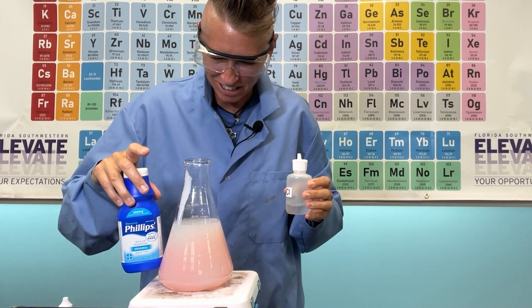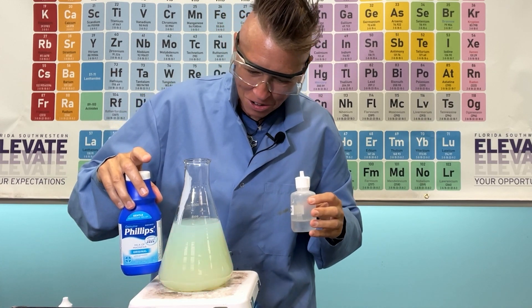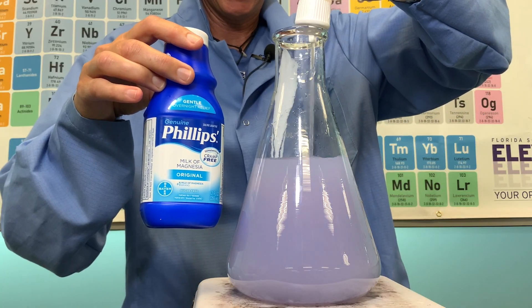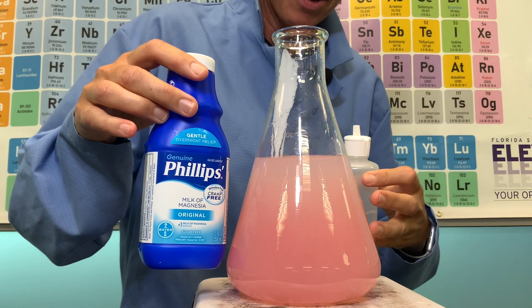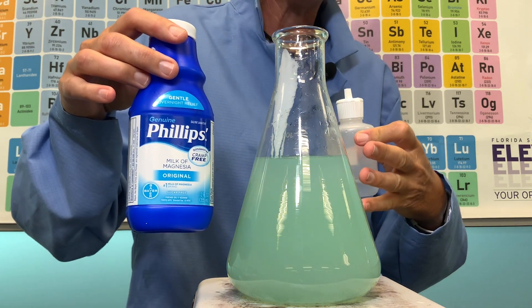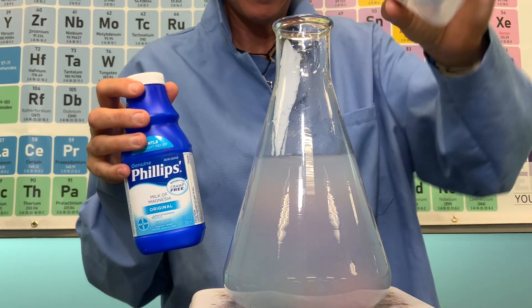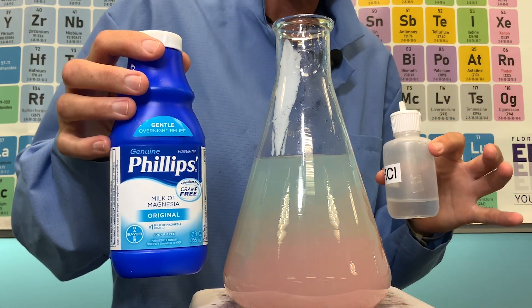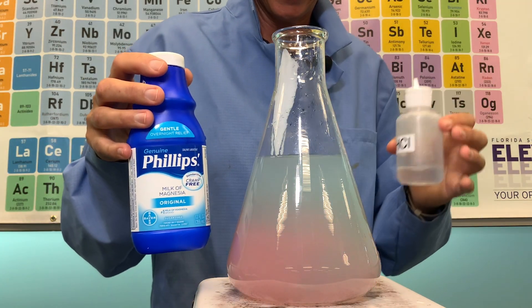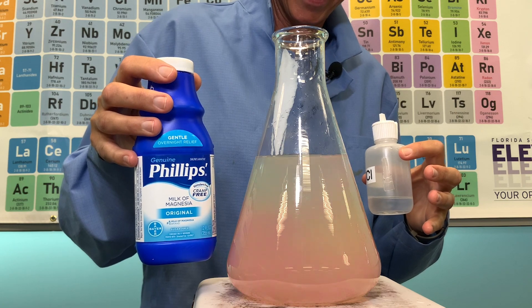The fact that magnesium hydroxide is sparingly soluble in water contributes to its classification as a weak base. But it really is just the interaction of the magnesium hydroxide with the water solution. When acid is added, the solubility increases, making the magnesium hydroxide more soluble in water, and that interaction does move towards a neutralization reaction.